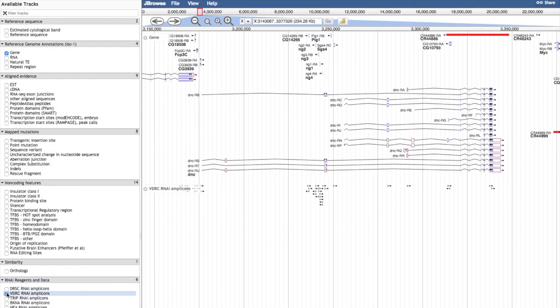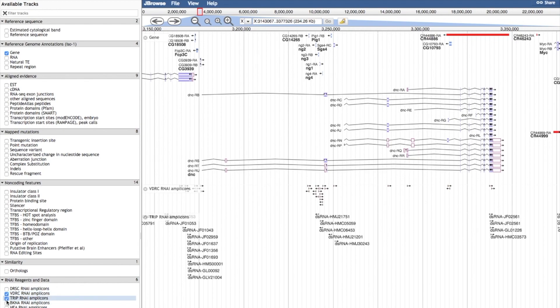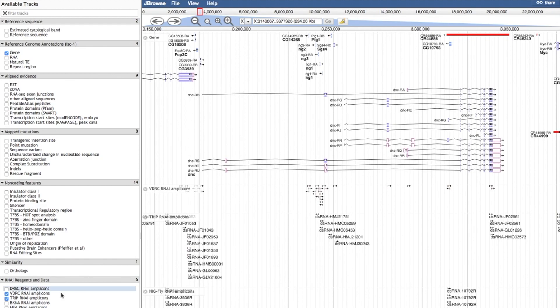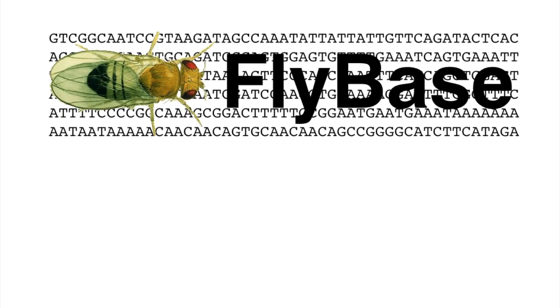RNAi amplicons, such as those used to generate stocks from VDRC, TRiP, or NIG, can also be added as tracks. Why not give JBrowse a try?